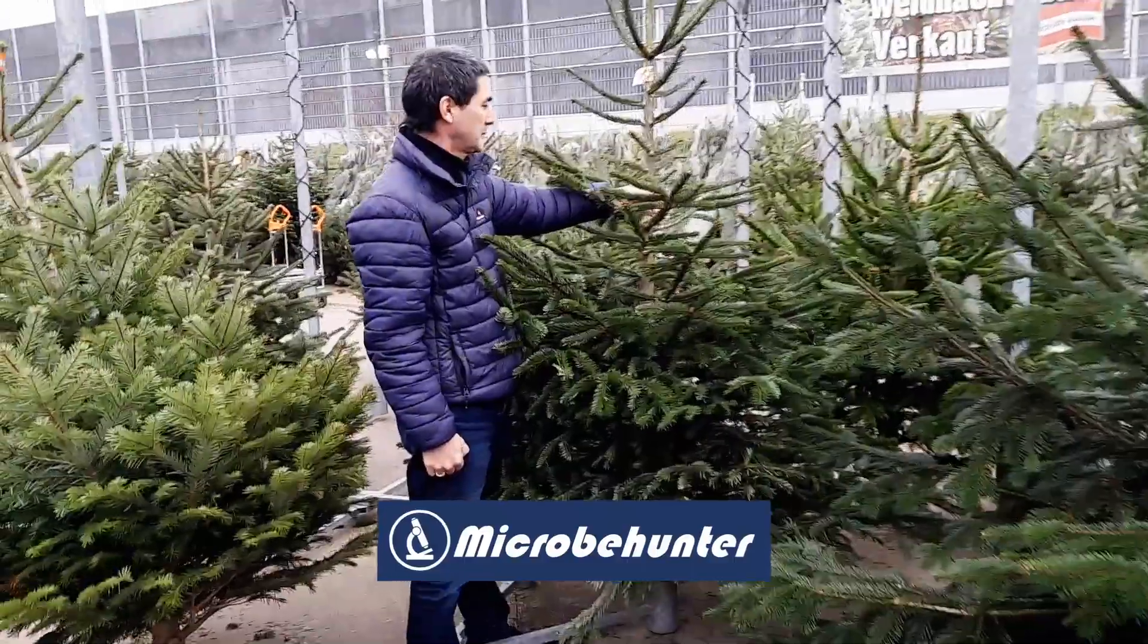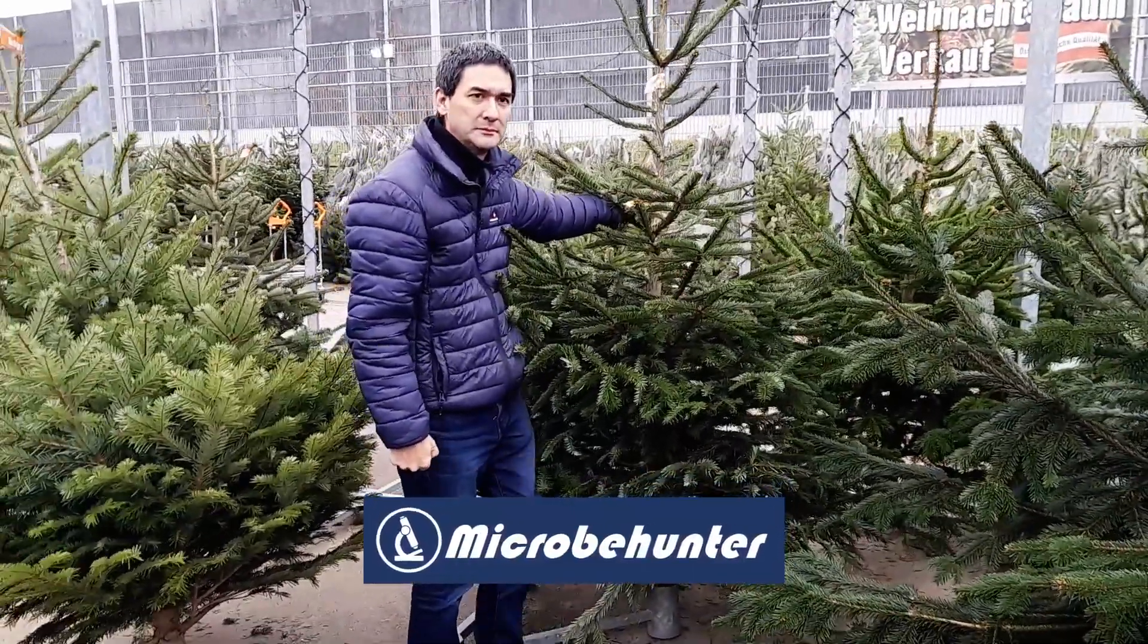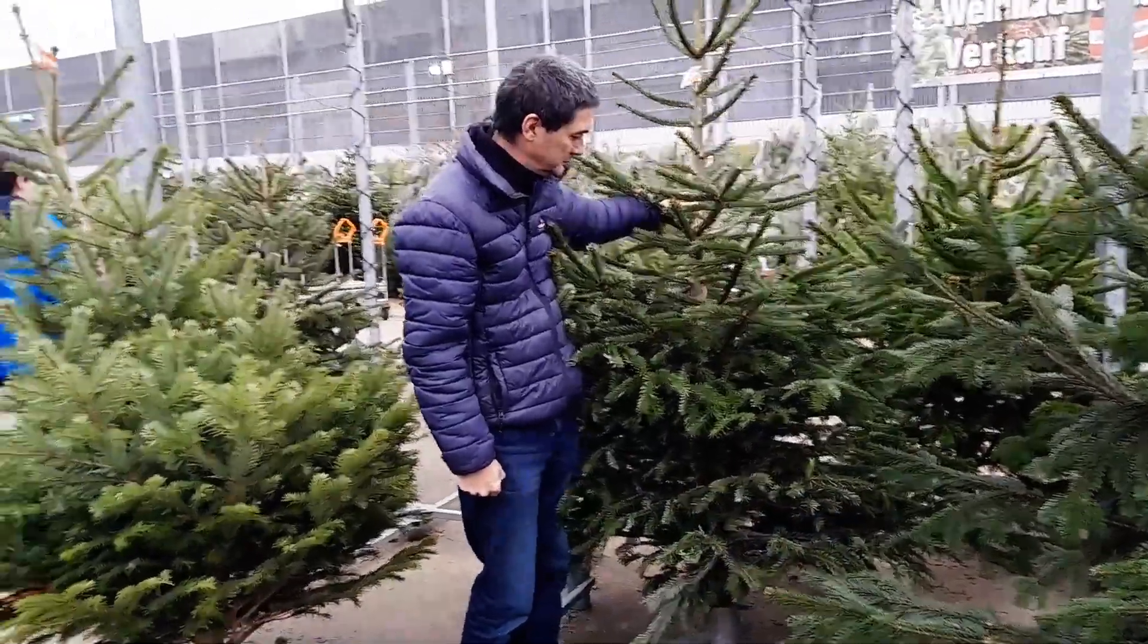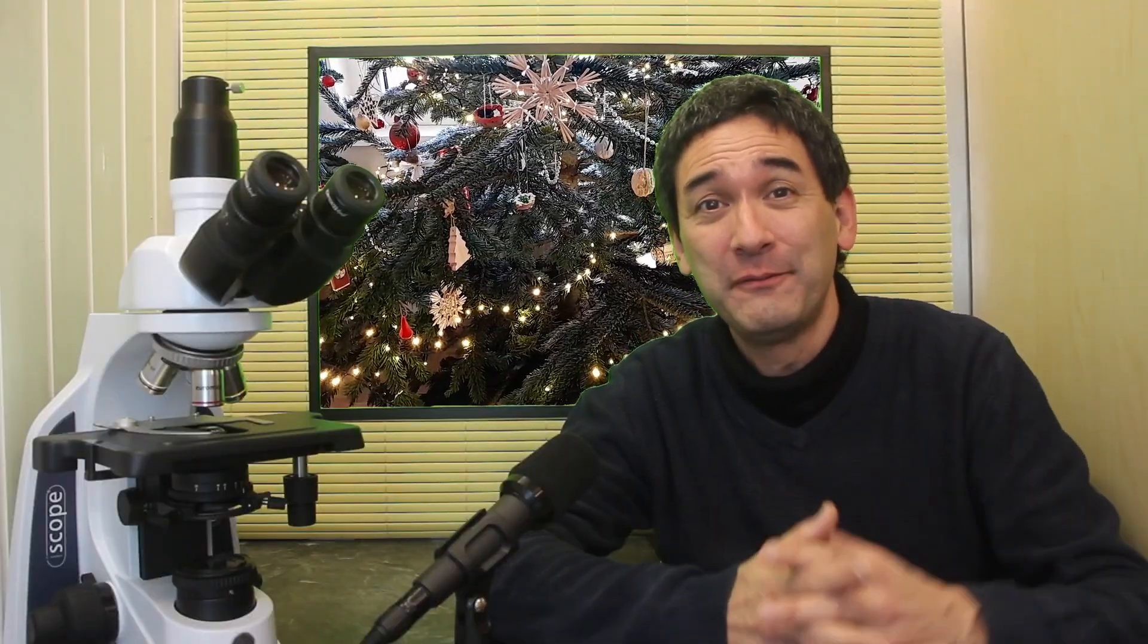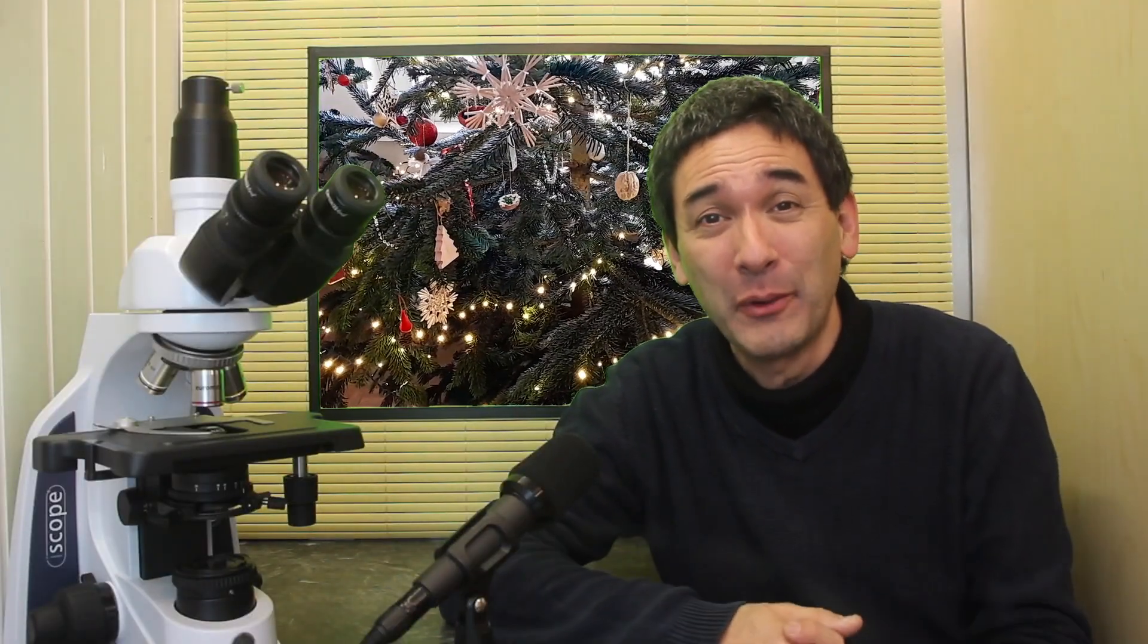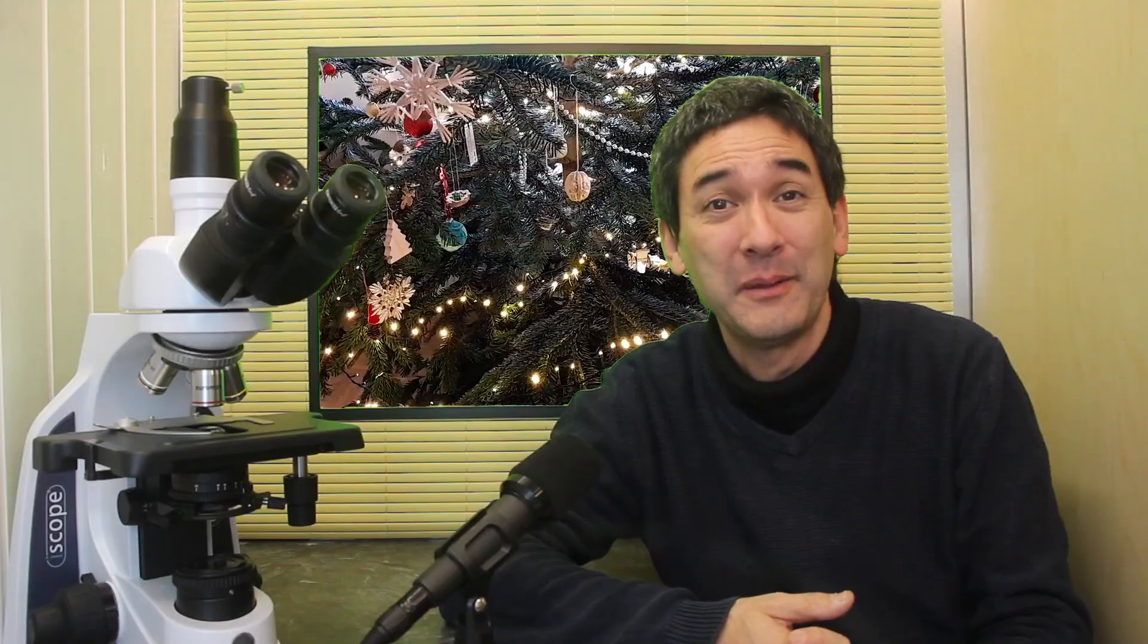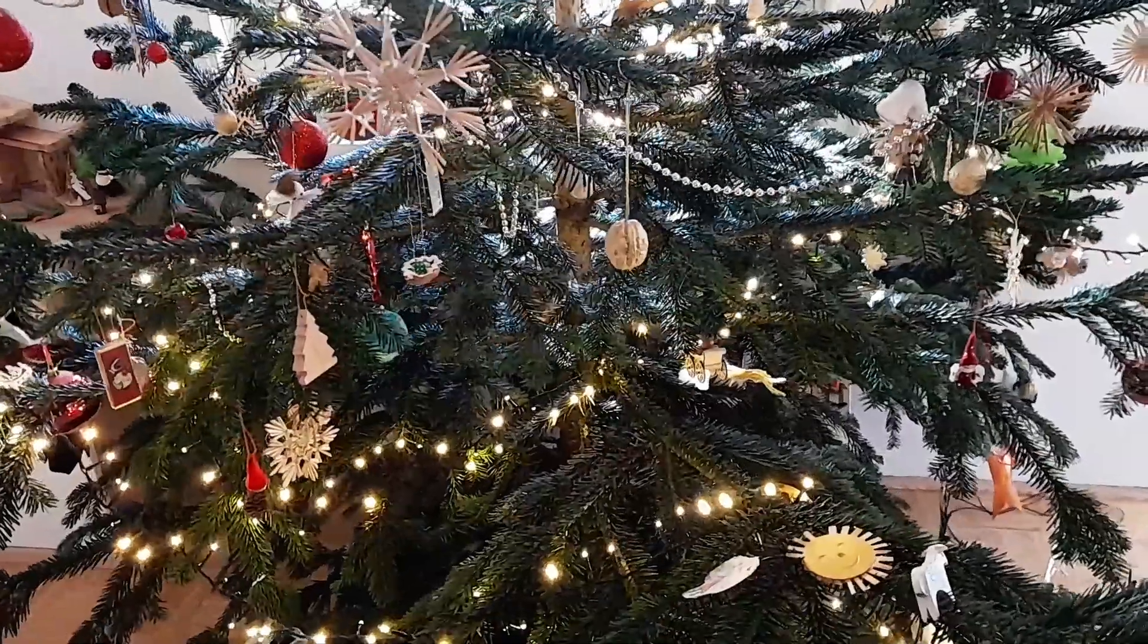So hi, hello and welcome again. Microbe Hunter here. Did you actually know that there are no less than 327 billion cells in a Christmas tree? I didn't know that myself until I figured it out, and today in this video I want to share with you the method that I use to determine this number of cells.